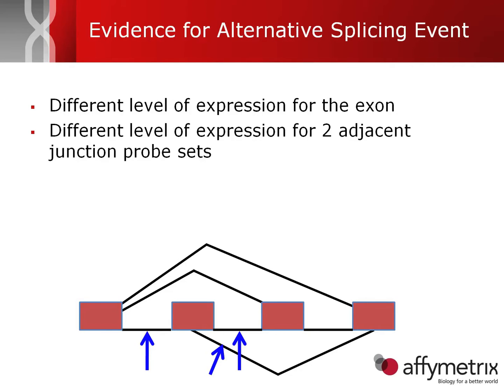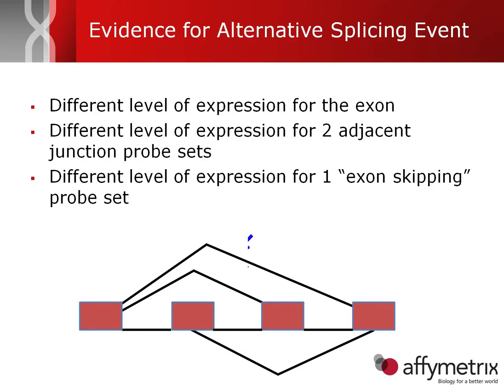So if the exon is spliced in, then two of these junctions should also be included. In addition, you can look at the differential expression for one of the exon skipping events, or overhead probesets. If we're looking at this exon here, you can see these probesets go over the top of it. So if this exon is spliced in, then one of these two overhead junctions should be decreased.